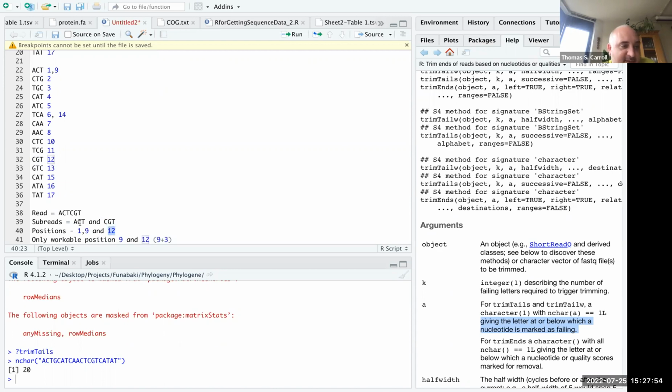And then if we think about this logically, and this is what a computer would do, only 9 works: if I add 3 to 9, it's going to be 12. So the only position this would really have worked at was if ACT was at the 9th position, which would allow these bases, 3 base pairs further along, to be here at the 12th position. So very simply, with a read of 6 base pairs and this tiny genome, we would be able to make a decision on where this read should map. Okay, so that's the very simple basics of how an index system works.